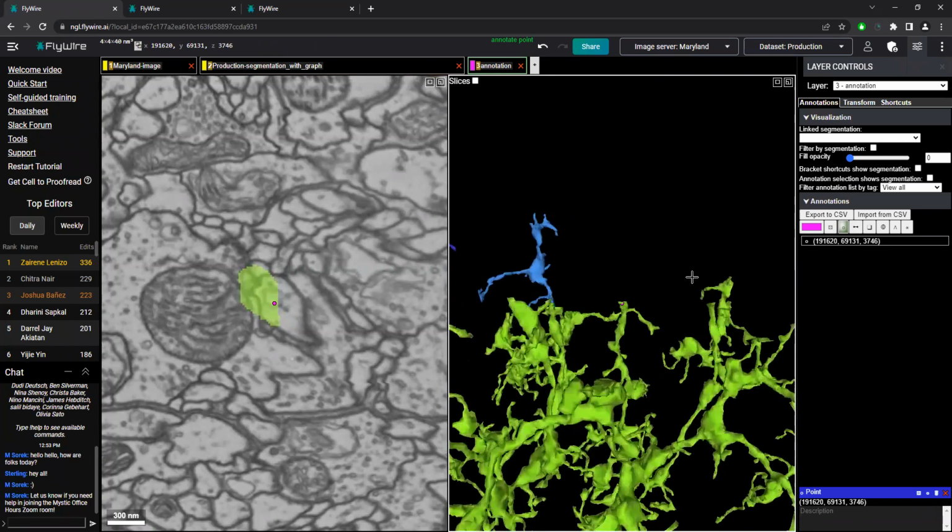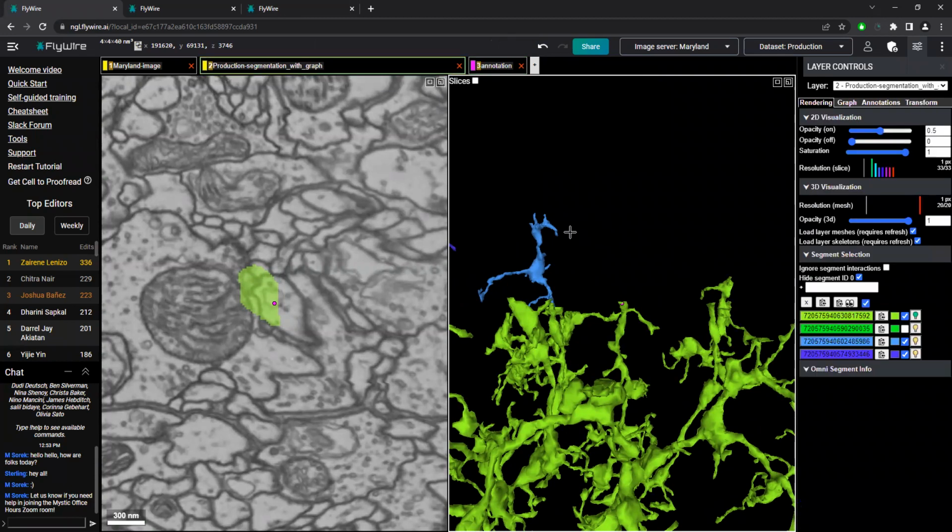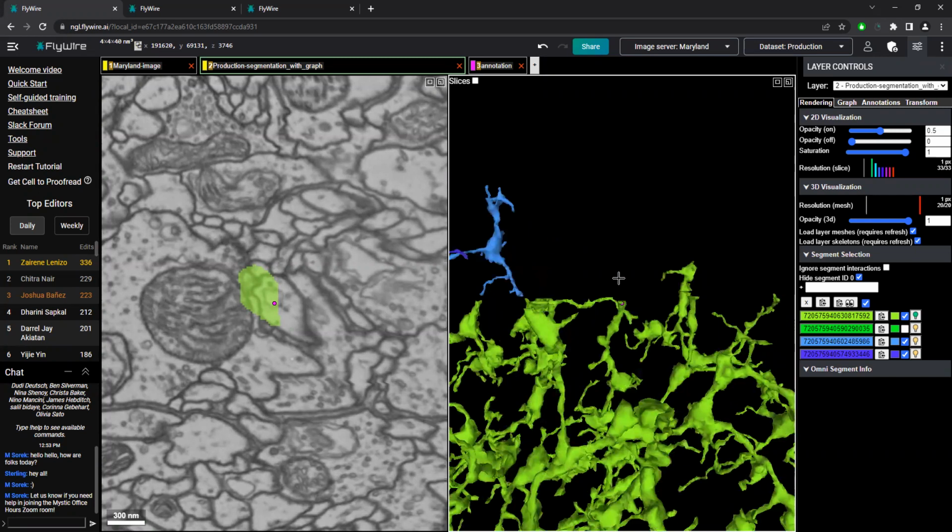When you have several different cells in there, is there any way to click on the numbers and get centered on that cell if it's a small nub? I don't think there is a way to do that currently. That would be a really nice feature though. Yeah, unfortunately not. It makes it a little difficult for jumping like that.